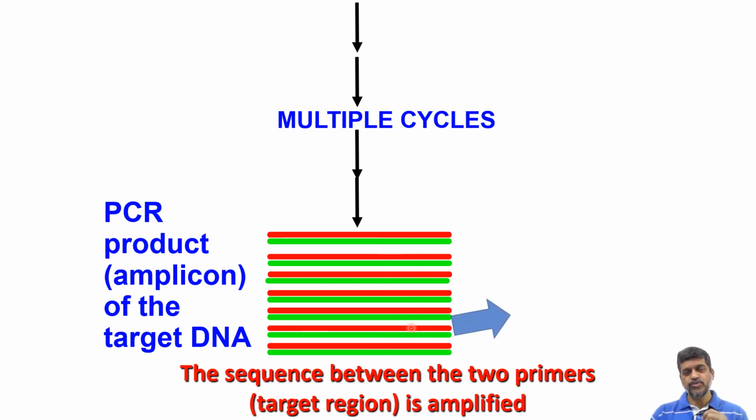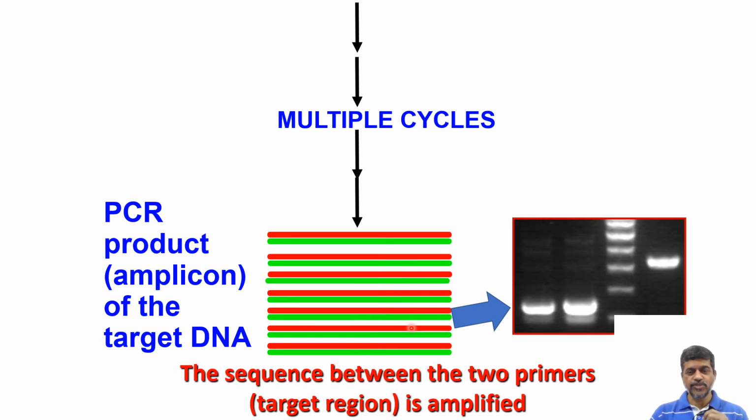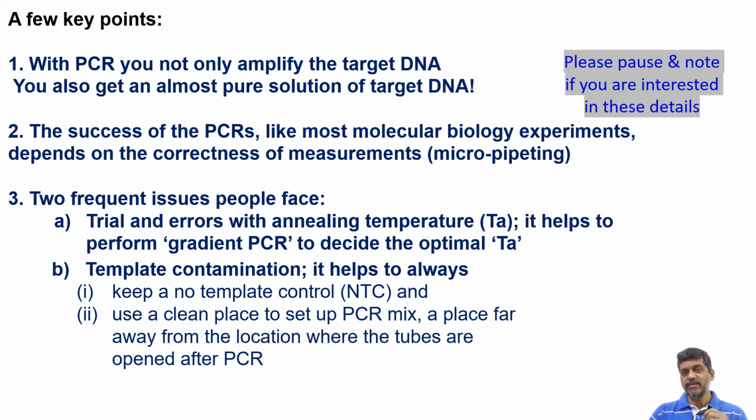A part of that solution will be taken and we perform electrophoresis. If we see the expected band at the right size, we know PCR has almost worked, but we need to confirm it by sequencing in most cases. So if you're a beginner in PCR, there are a lot of things that you should know. Some points I have listed here. You can pause the video and note them.